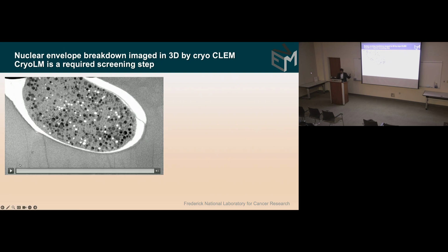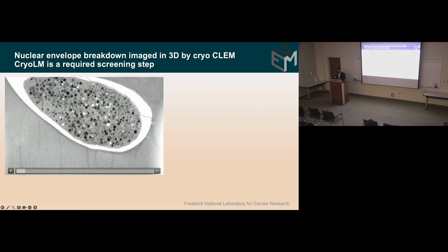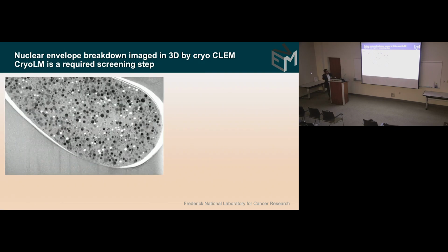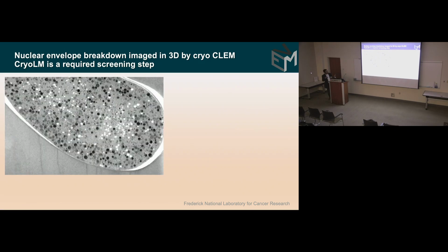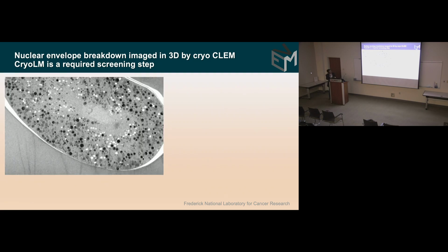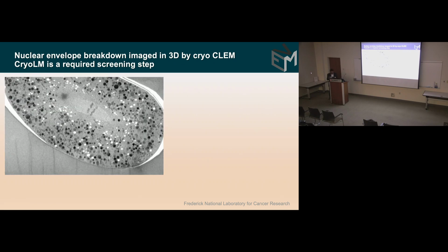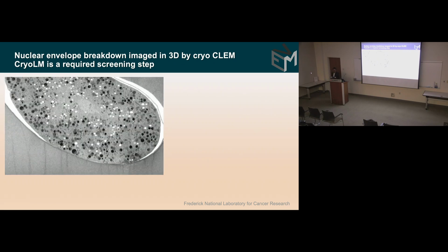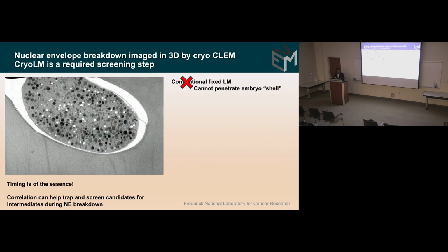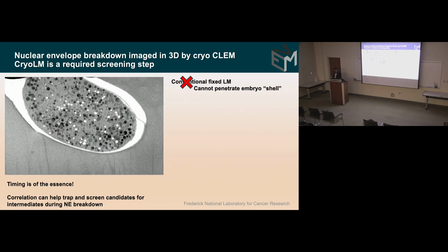And because doing this by high pressure freezing is the way to do it, it's a real pain, it's difficult to do, and FibSem imaging also takes a long time. It means that you must get the timing just right in order to get the DNA lined up at the metaphase plate just as the nuclear envelope breakdown is happening. So timing is of the essence, right?